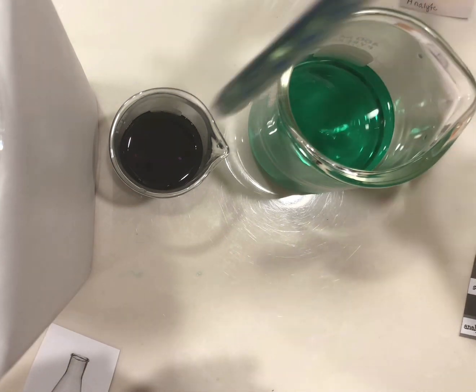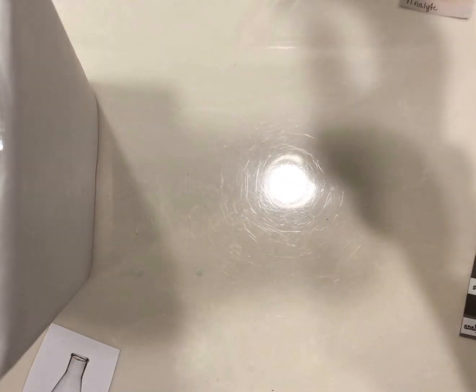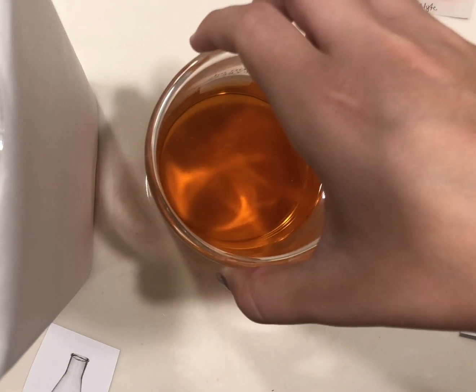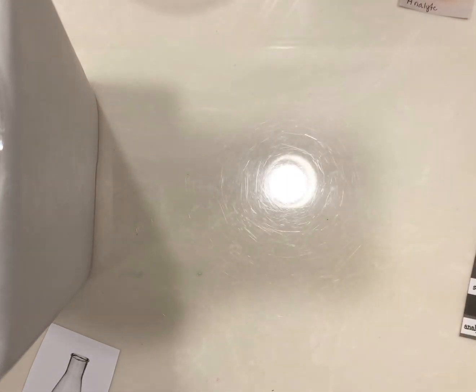That was about 4 drops. So putting that off to the side. Once we've put in the desired amount of drops, which can vary, we want to make sure the last drop we do is a half drop, and that will give us this sort of pale orange color. If it goes all the way to red, you know you've overshot.